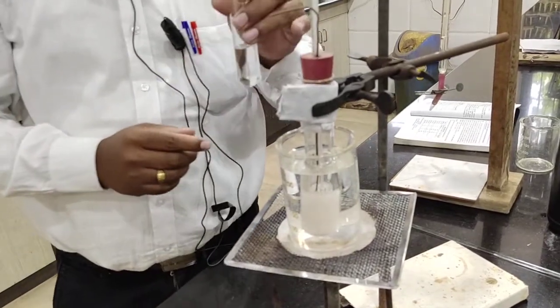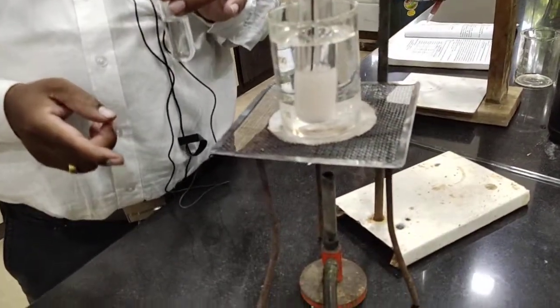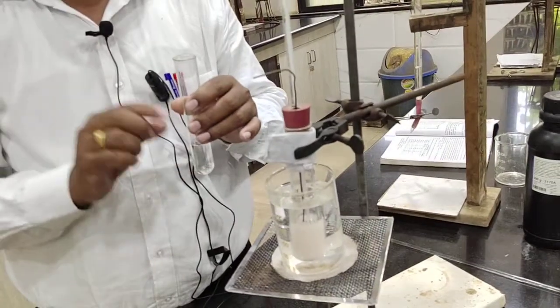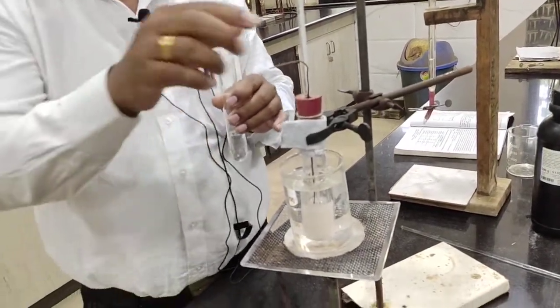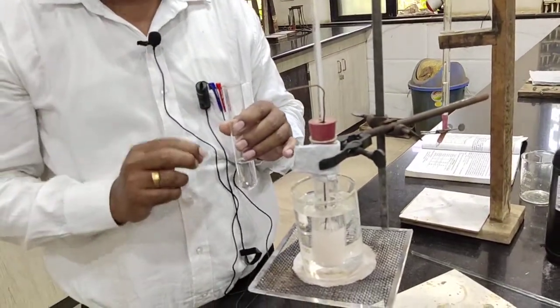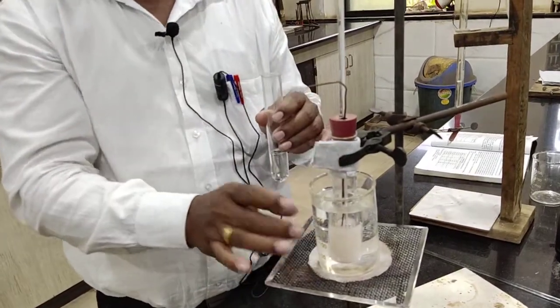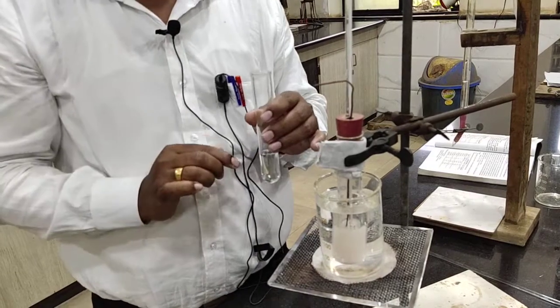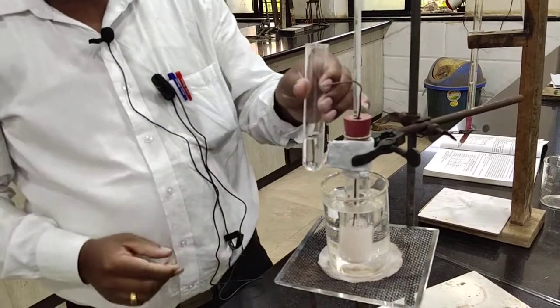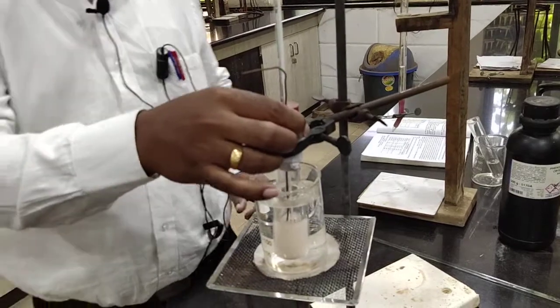So why do we have to do it like this? Because we know the heating procedure is a very fast procedure. We can't get the actual temperature of mixing. So that's why we take that first as T1. Then the cooling procedure is a slow process. So whatever temperature we get when the solution becomes turbid, that is T2, then we take the mean of T1 and T2. Accordingly we do this for each particular composition of phenol and water.